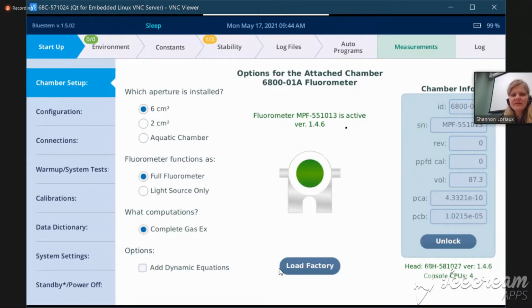There are various processors in this, which is something helpful to understand. There is a little computer chip up inside the chamber, the base of the sensor head, and there's also a computer processor in the console. So there's various places where we actually can have different software versions, as well as different serial numbers. And so by default, we remember all of that for your instrument. So the nice thing is, if you wanted to use another lab's chamber, you don't have to give them anything, it will auto read all of that information into the console.